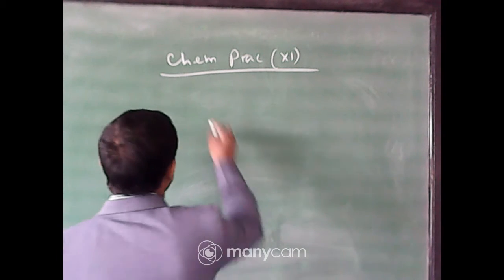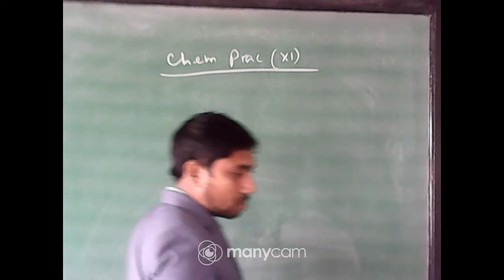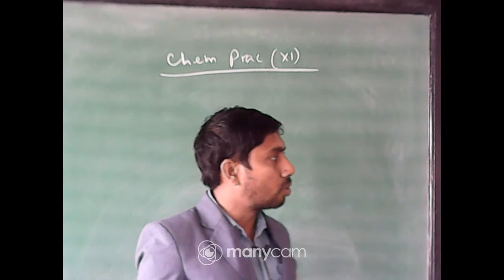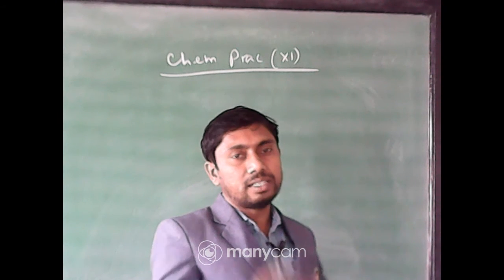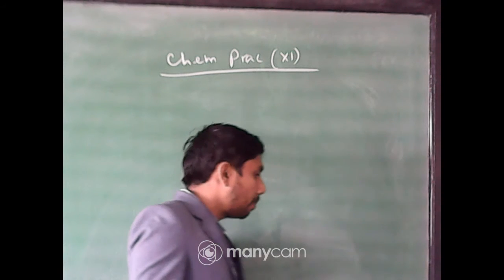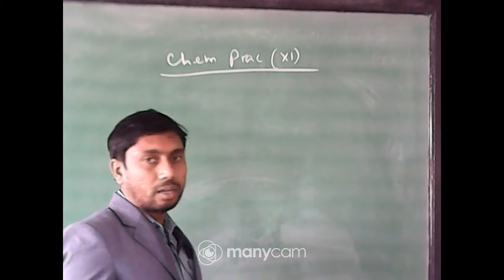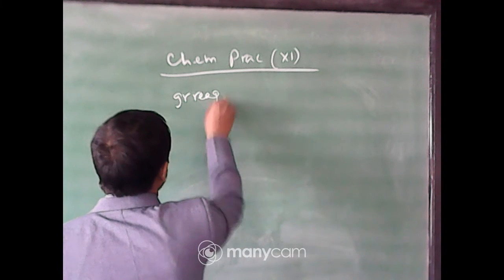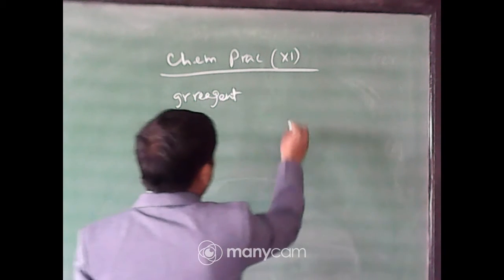You know that inorganic cations are divided into 6 groups according to your syllabus. As it is classified into 6 groups, the 6 different groups have 6 different group reagents. So, group reagent and cations.